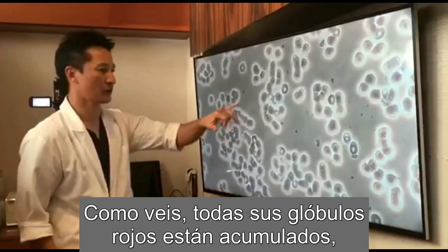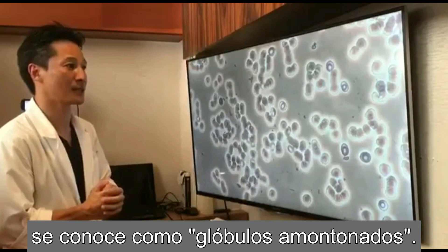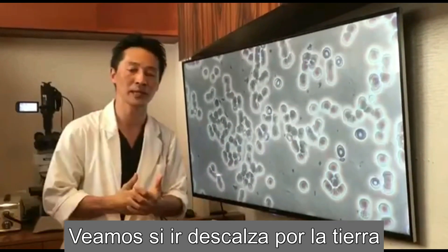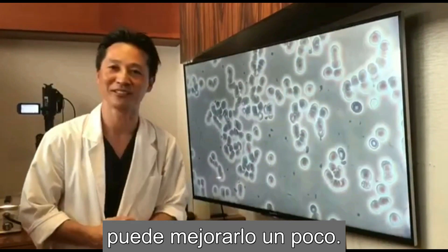As you can see, all her red blood cells are stacked up. This is called a stacked up cell. Let's go see if the earthing can help improve a little.